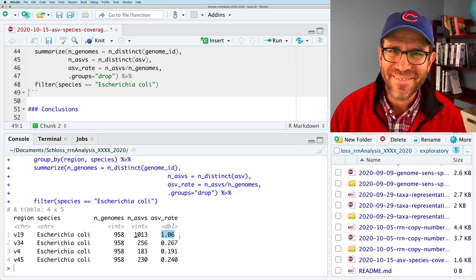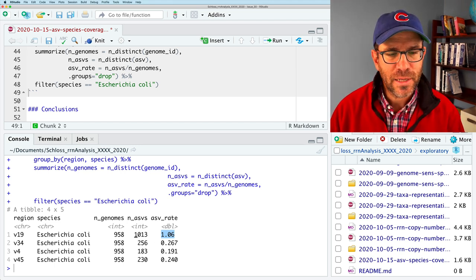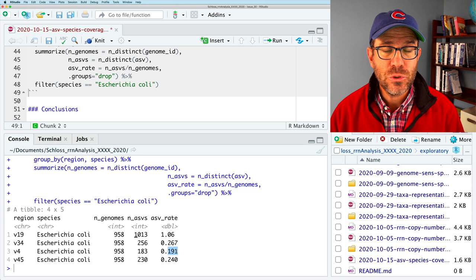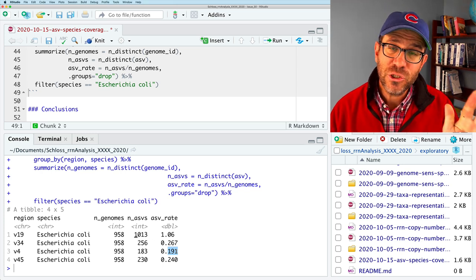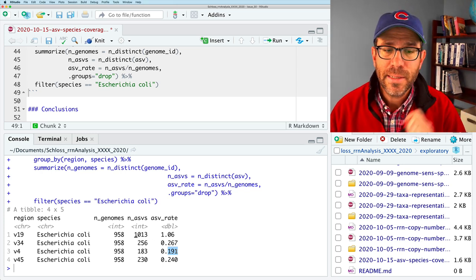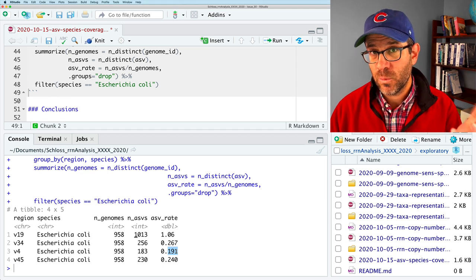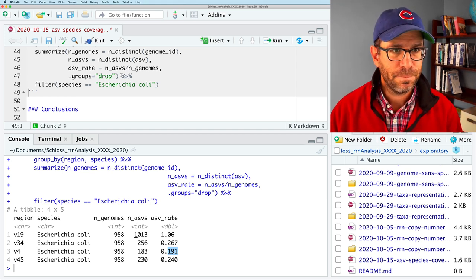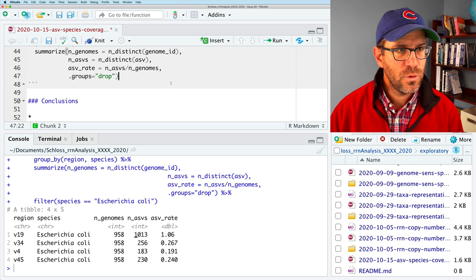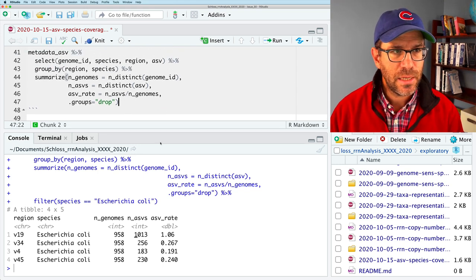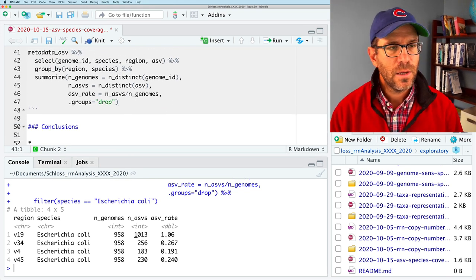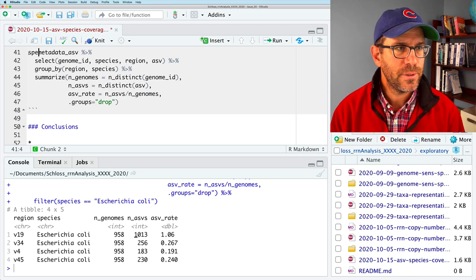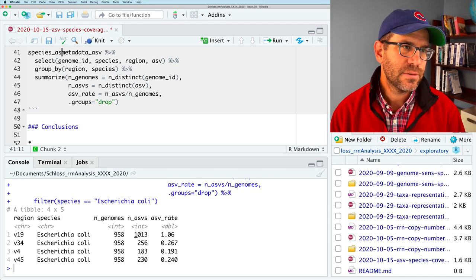So I'm going to leave it with n ASVs divided by n genomes. And I'm going to call this the ASV rate. And I'm going to do dot groups equals drop. If we run this, then we'll see the summary data for E. coli. And again, we see our ASV rate, as we'd expect, the number of ASVs per genome for Escherichia coli is over one. So every time we add a new genome of E. coli, on average, we get one new ASV, which is, I think, a lot.